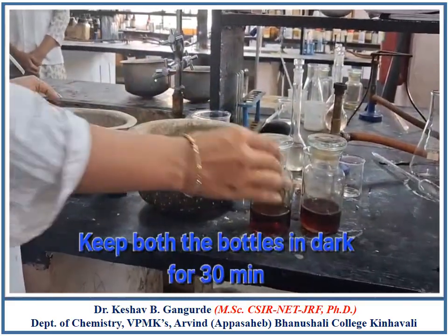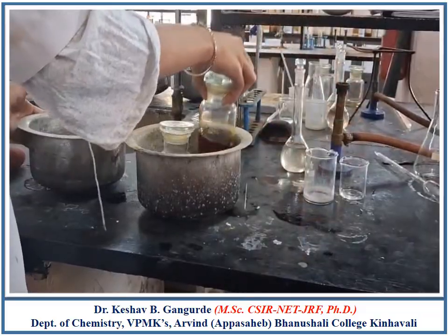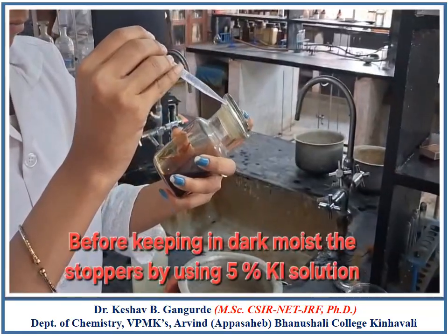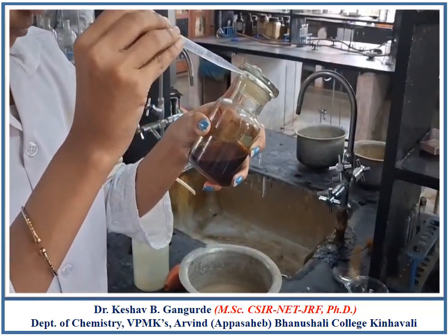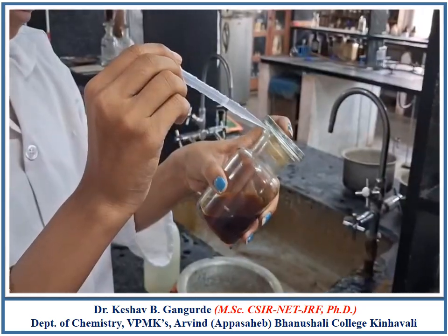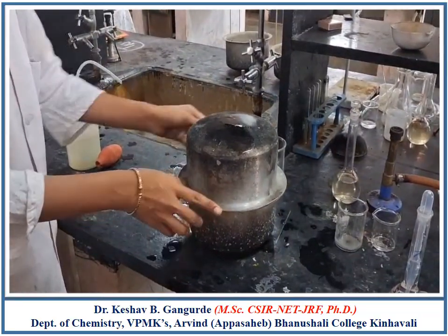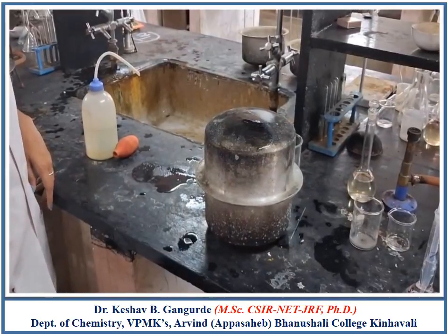Now place both the bottles in dark for half an hour. Before placing them, moist the stoppers of both the bottles by using 5% KI solution. Keep the bottles in dark for half an hour.